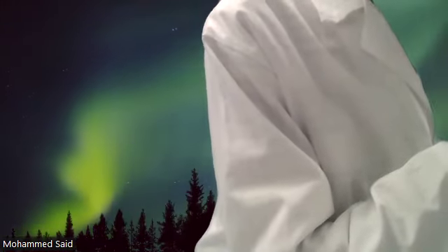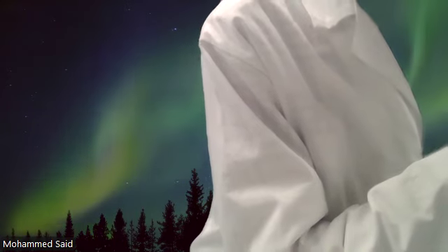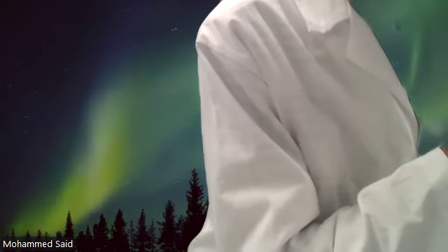Okay, I'm going to start asking by groups where you are in terms of exercises. Exercise 1 was inoculating your subcultures. Exercise 2 is your gram stain. Exercise 3 is capsule.